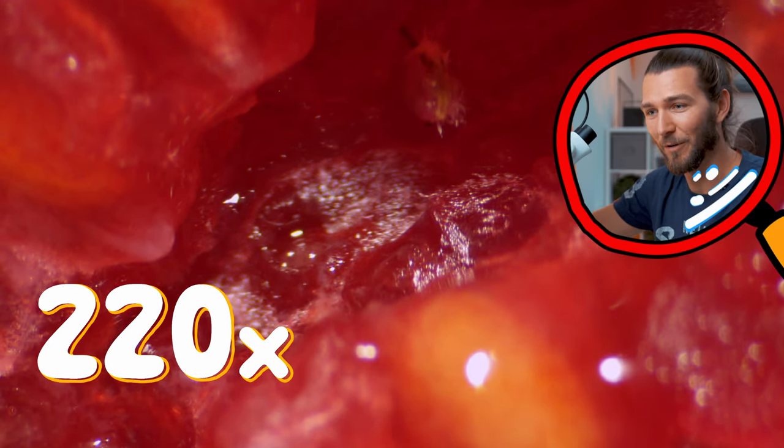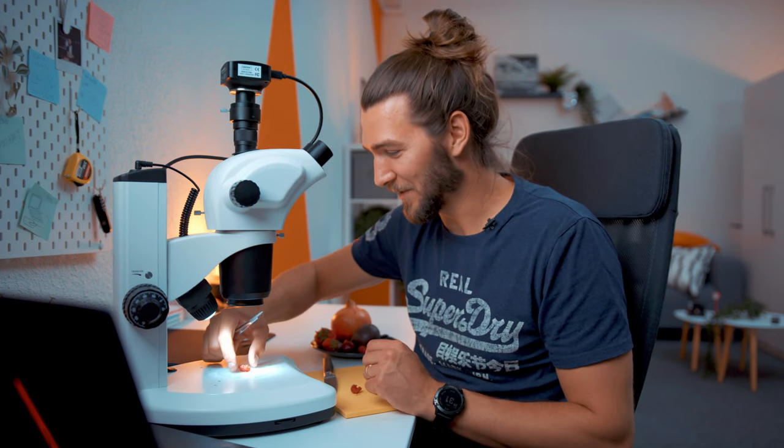What are these whiskers inside the raspberry? I didn't know there can be whiskers inside! Okay, enough of this raspberry — that's the easiest way to clean it up. It's gonna grow in my stomach now.